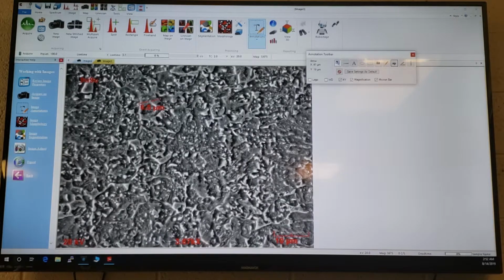I can point to something, great. There's also, again, the measurement feature. That angle thing is cool too. Yep, you can measure angles. You can throw that up there.